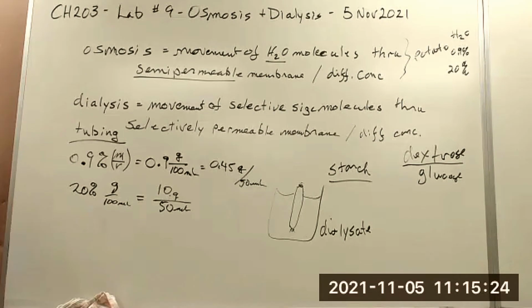The first table is potatoes. So you're going to measure the mass of the potato core, the length of the core in millimeters. So you need a ruler. Millimeters. Something like this. Each of your kids should have one of those. And the texture. Just say, you know, is it rigid? Is it limp? Is it squish? Things like that. That's before, and then after, do the same measurements after it's soaked.